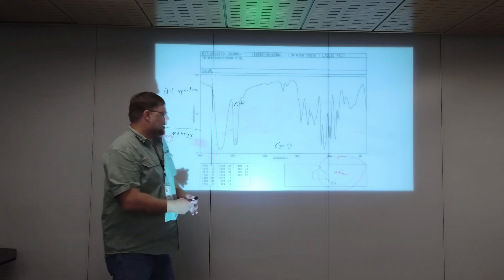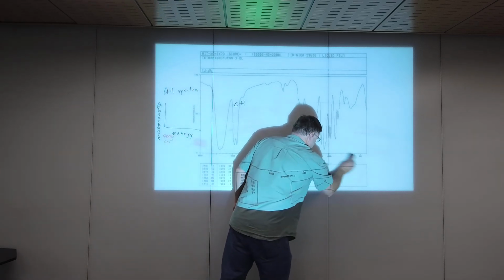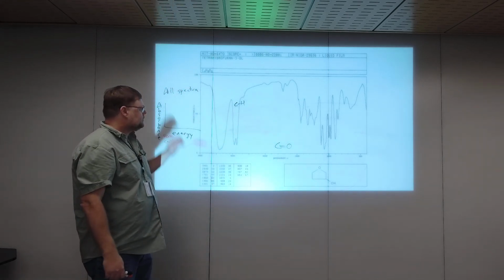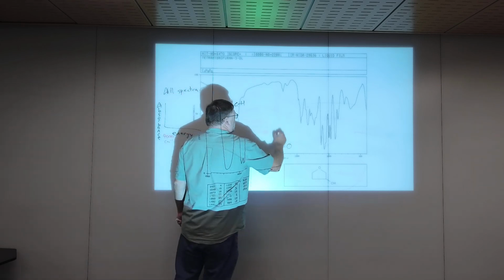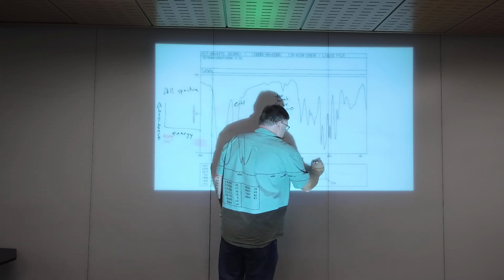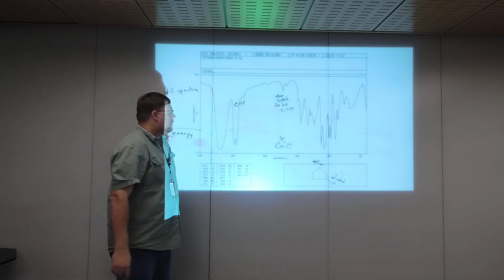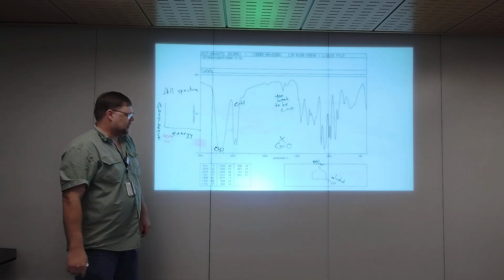Right, so again, now we've got a molecule. We don't have a carbonyl. Functional groups. Hit pause and think about what the functional groups are. Okay, you're back. First of all, we don't have a carbonyl. These are too weak to be a carbonyl. What we have is an ether and an alcohol. There's the OH, and we've got CH again, basically in that same spot.